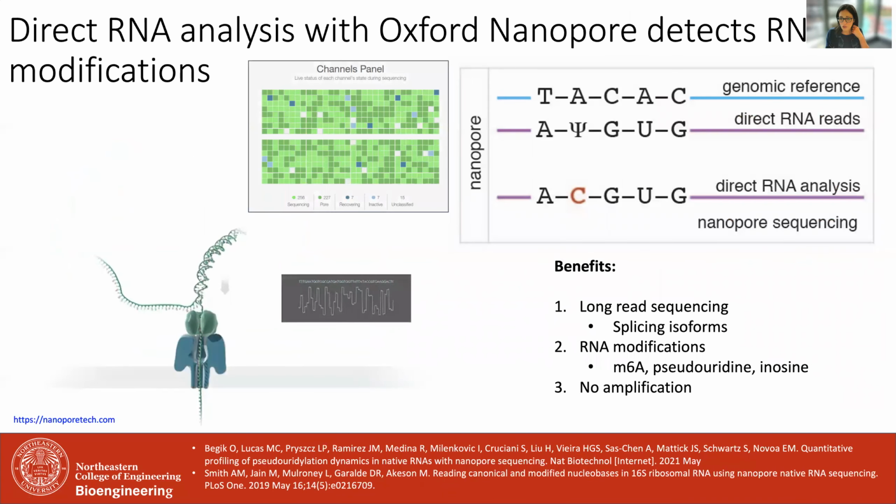So what we wanted to do was to do long read sequencing so that we could detect these modifications directly, because whenever you're using a chemical, the chemical is not going to be 100% efficient. And also the strong base treatment is not really good for your RNA fidelity. And those methods are only able to pick up the very highly modified RNAs, and you can't pick up the other modifications at the same time. So we wanted to use long read sequencing.